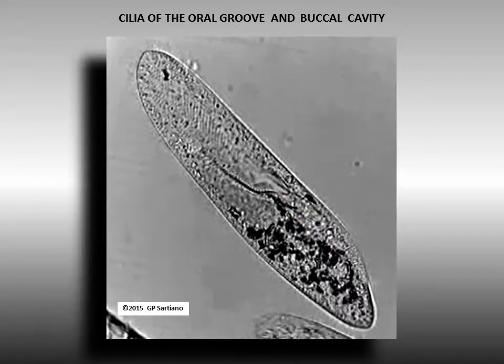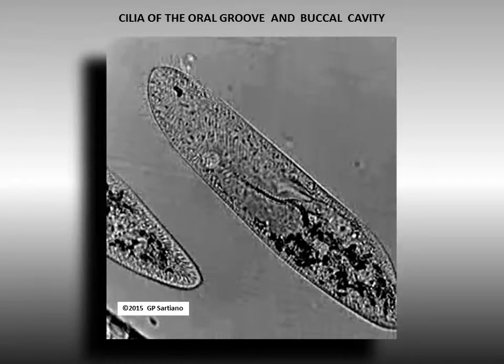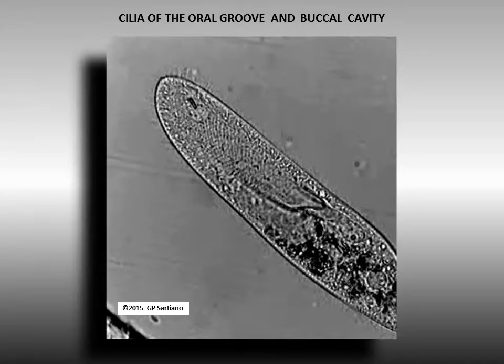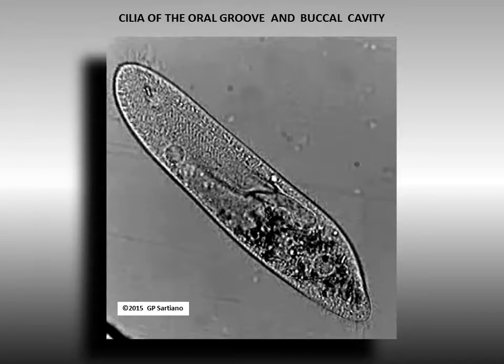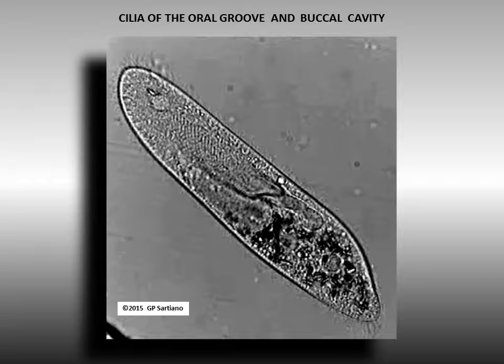Note the metachronously synchronized wave-like motion of the preoral cilia and the rapid motions of the coarse cilia deep in the buccal cavity.